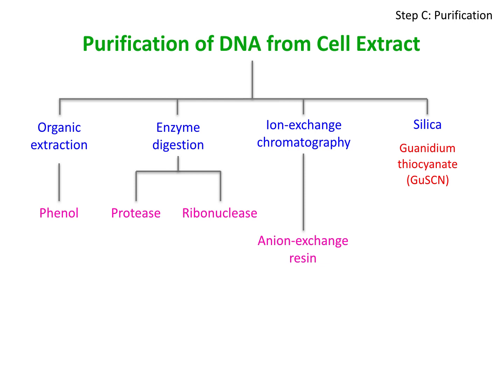It is a known fact that water is present inside as well as outside the cell. And we also know that hydrogen bonds in water molecules play a huge role in functions like the maintenance of structure of cell membranes or the suspension of proteins and other biochemicals in the cytoplasm. Since guanidinium thiocyanate disrupts these hydrogen bonds, it is very commonly used for animal cell lysis as well. Can you guess why? The reason is that animal cells do not have cell wall. So, guanidinium thiocyanate directly disintegrates the cell membrane.